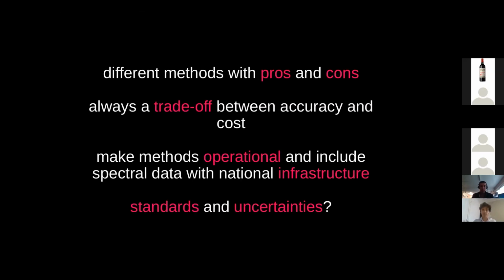There's always a trade-off between accuracy and cost when it comes to picking between the different spectroscopy methods. Making the method operational certainly gave us a lot of new challenges, which is unglamorous from a science perspective but very necessary. And finally, in terms of standards, there's not necessarily a lot around, but it's an emerging topic.